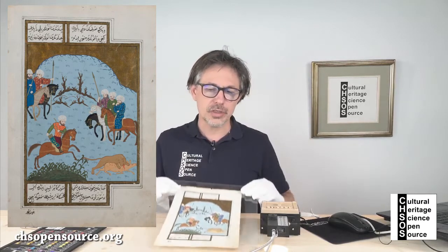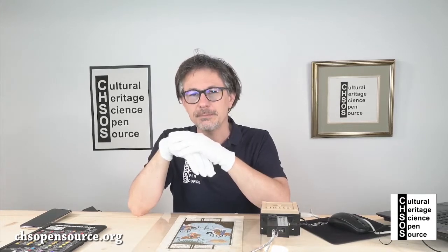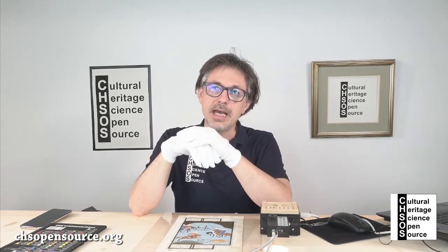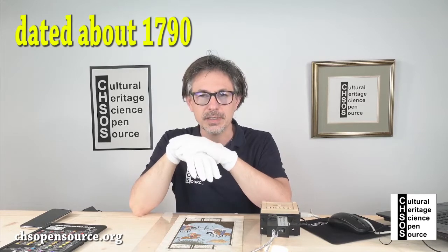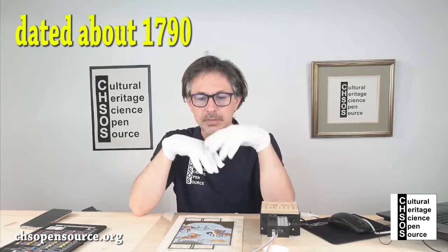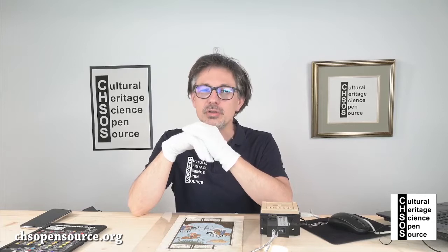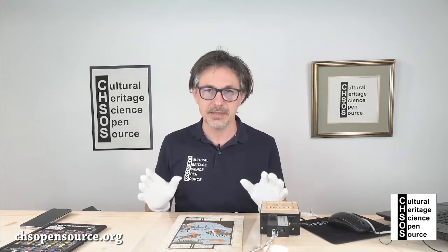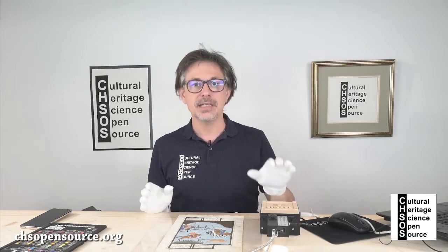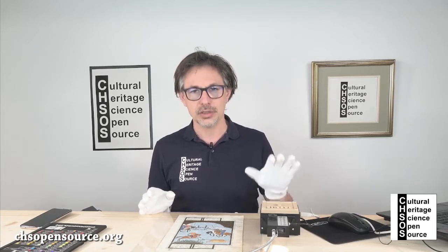This manuscript was dated at the auction as an 18th century manuscript, Indian Mughal, with Persian knights. We are going to see what kind of information we can get from the analysis of the pigments. Analysis done with reflectance spectroscopy and using the standard Gorgias system.